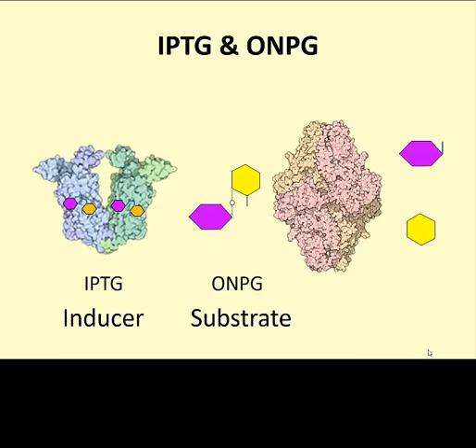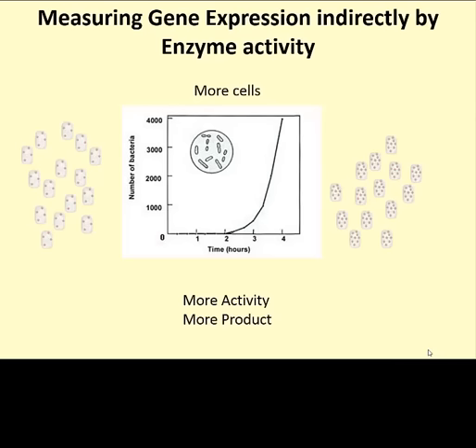However, there is a time factor. To switch on the operon and to express the genes takes time. Furthermore, while we wait for any amount of time, the E. coli cells in culture will keep growing too. To correctly estimate the amount of enzymes produced per cell, we have to take into account the number of cells in our test tube. Over time, the cells will multiply.